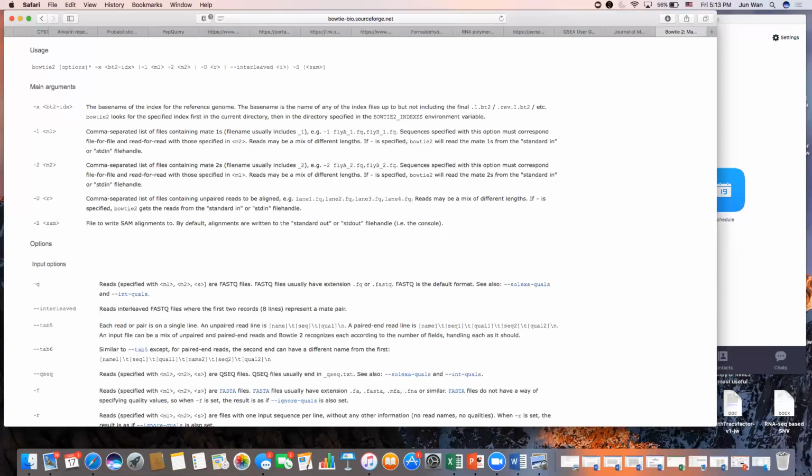Now, when you type in something called --local, have you noticed anything about this aligner so far that you haven't seen that you used before with BWA? What were the steps before you used BWA? You went through FastQC and then Trim Galore. You don't see trimming, right? So what this local command does is it's called soft clipping or soft trimming. It'll shave a few bases off here and there to improve alignments. So if it takes off 3 on one end, but it makes a better alignment out of it, it actually makes it run more efficiently.